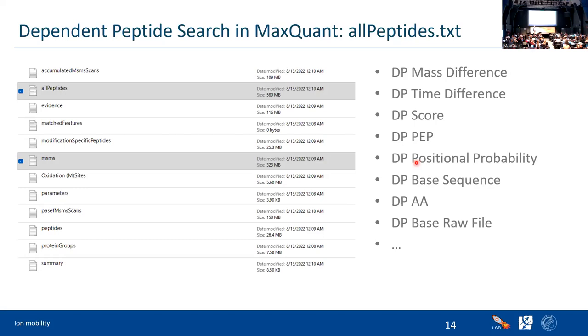Thank you. It's very interesting. I've never used it. Is it similar to a mass tolerance search? Does it give you delta Ms at the end, or does it give you the modifications that already exist in the MaxQuant Andromeda configuration?